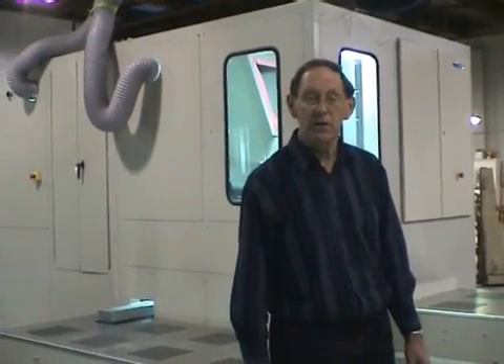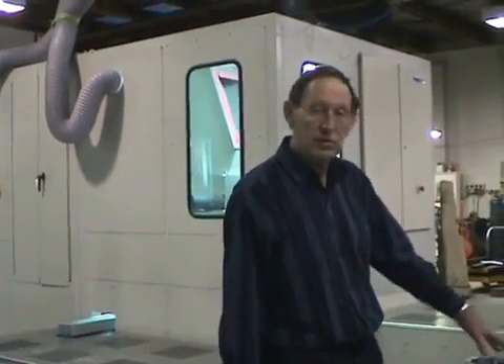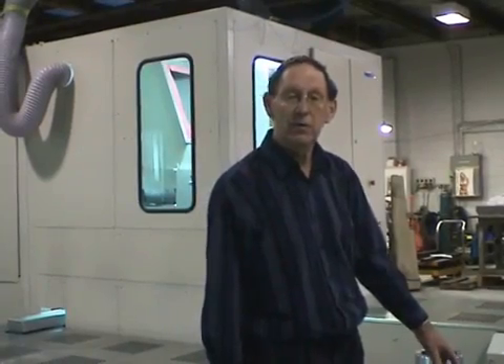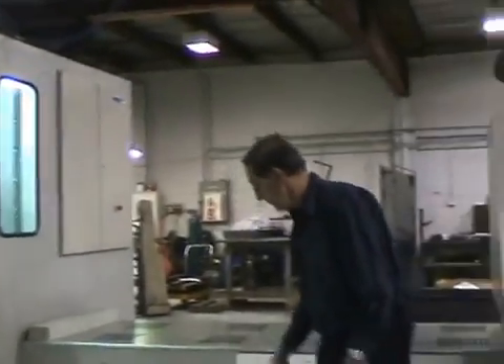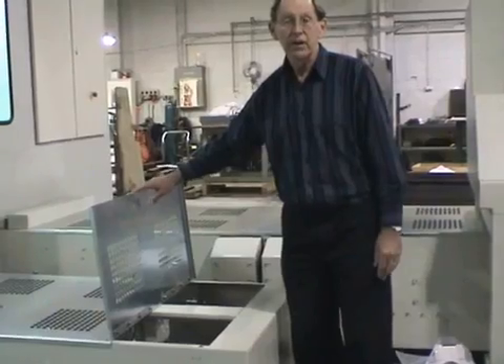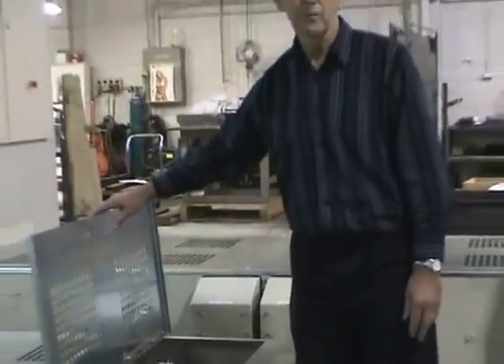When the sample is loaded into the sample loader originally, when it's going to be lifted up to the big boy crusher, that sample bag is brought to this conveyor. If the sample bag is damaged in some way, then we would use a new sample bag. This conveyor lid has a safety switch, so that if the lid is lifted, the conveyor is turned off so fingers cannot be damaged by moving bins.